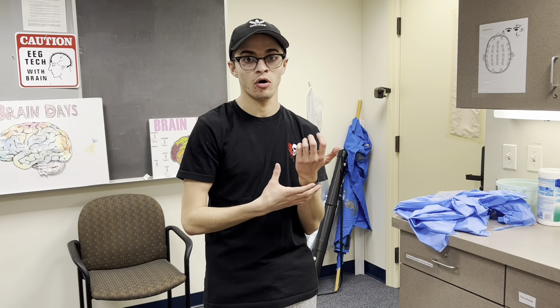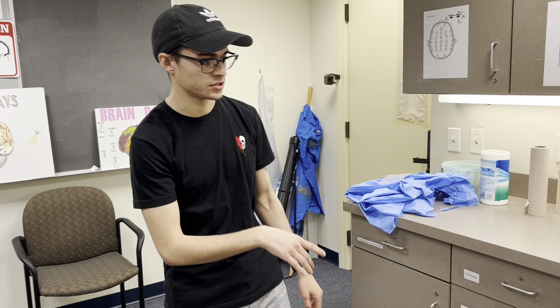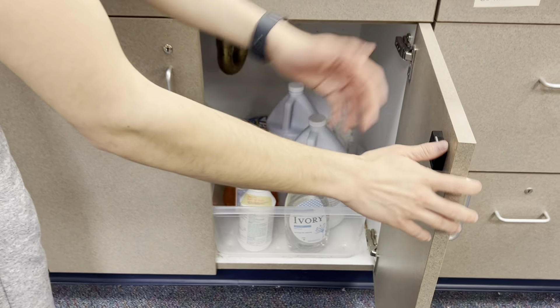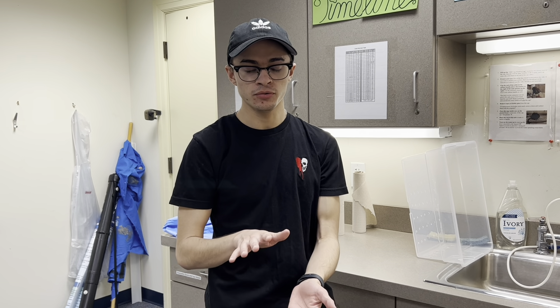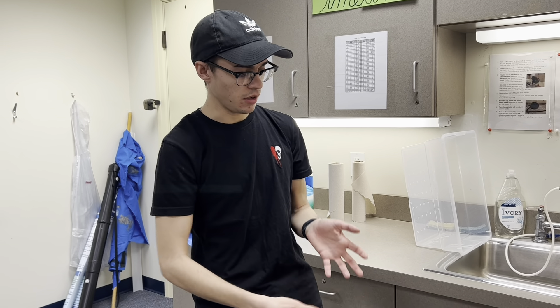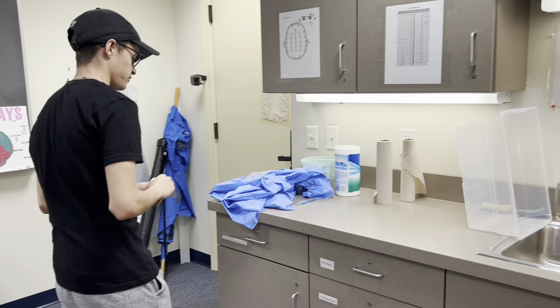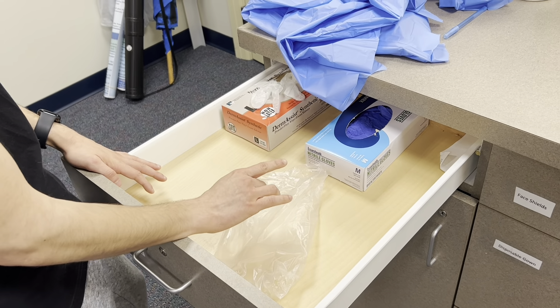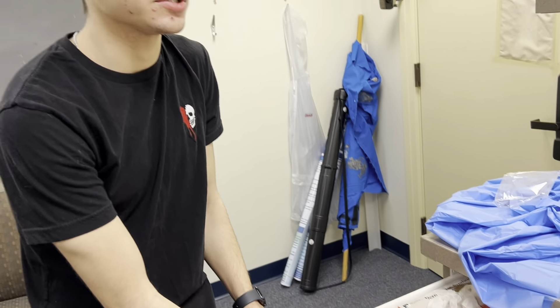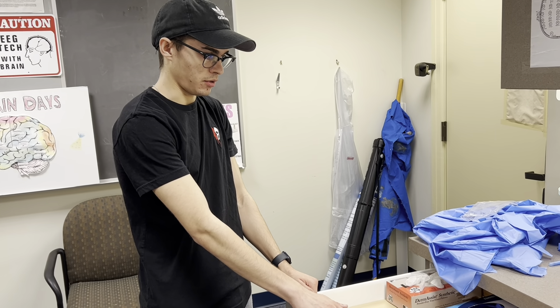You don't have to worry about getting any gel on your clothing. However, with long sleeves they are a bit of a preventative. The enviroside, which is found in this cabinet labeled with enviroside — this is the bottle — you shouldn't get it on your skin. It can cause a warm feeling and does have a warning label saying do not get on your skin. Moving on to the gear in the lab, we have the disposable gloves and masks, which are in this drawer. At the moment it's just the gloves, but you will be using these when working with the enviroside.